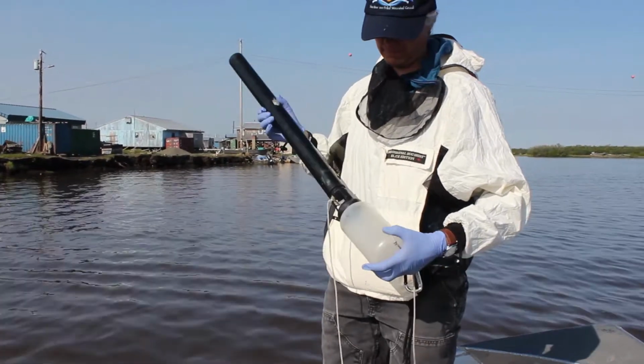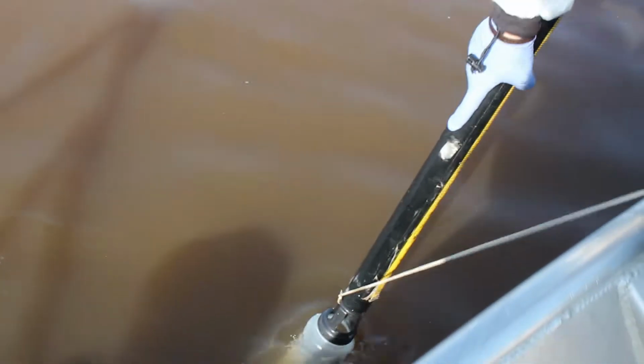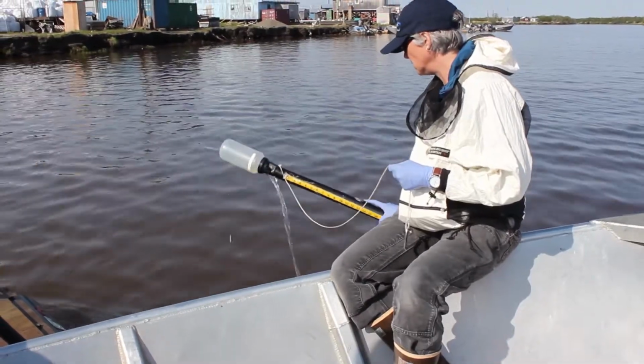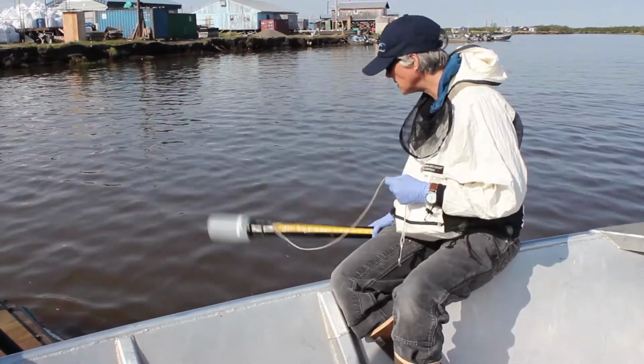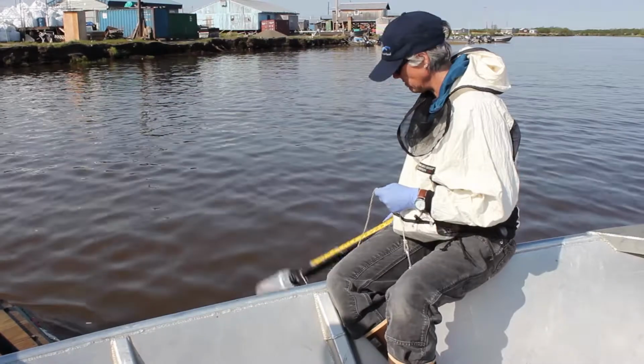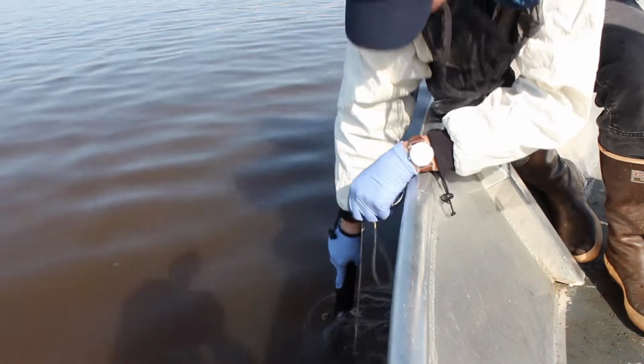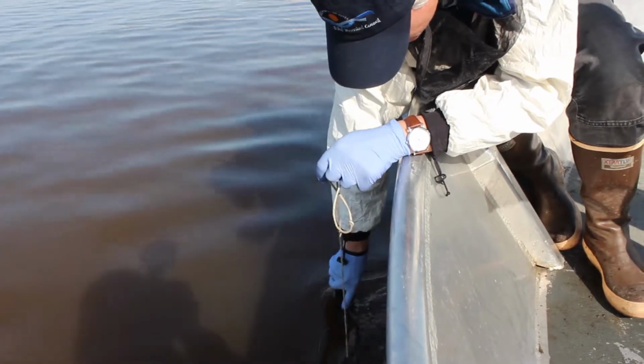To collect a sample of the water, screw the bottle onto a pole and rinse the bottle at least 3 times. Once it's rinsed, lower the bottle all the way into the water to collect the sample.